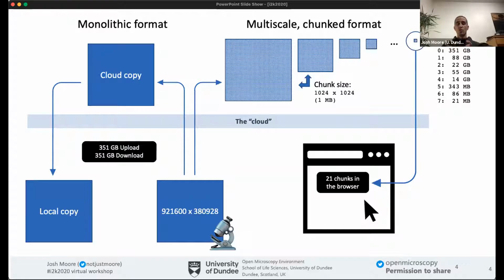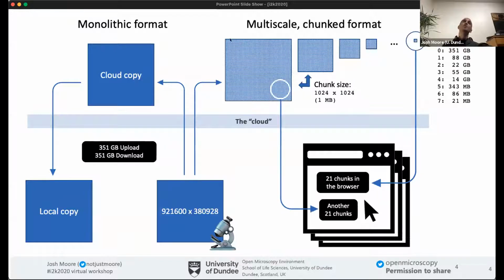And so the chunk size we've chosen is 1 megabyte. And it's something that others have done. Imaris does this. Other software that's much older than what we're talking about here basically says that's about what you can get on the fly. So you pick a good chunk size for what you want your users to do. And then as they zoom in, they're not loading all of the 1 megabyte chunks from the large data. They're now looking at just a region. And then you kind of have what you want. So that's the overall goal that we're trying to get to here, right?